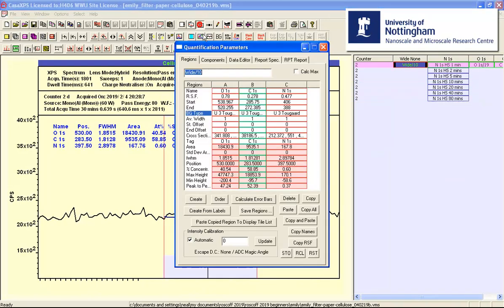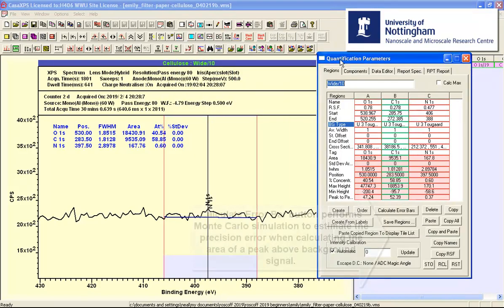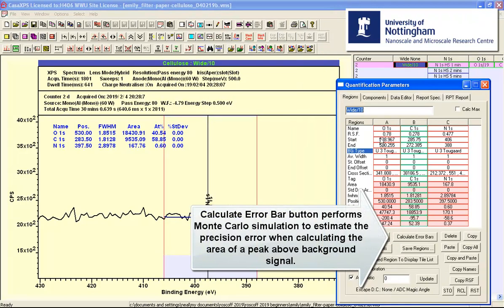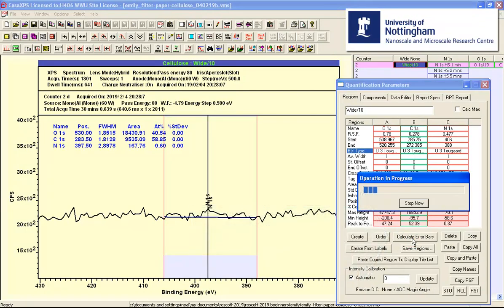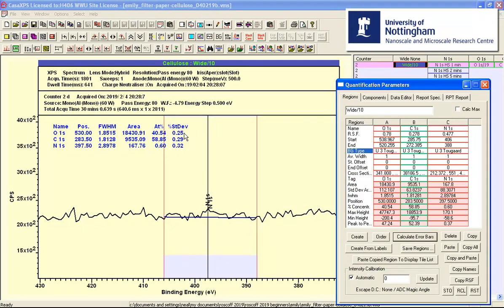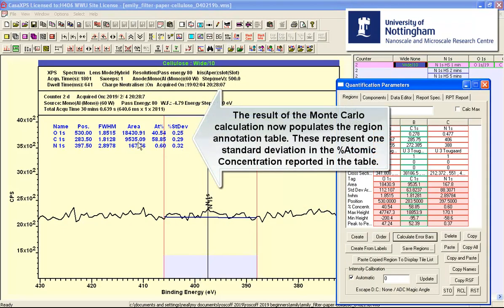I bring up the quantification parameters dialog window again. And we've got a single survey spectrum from which these regions are being calculated. So I can press the calculate error bars and this will do a Monte Carlo simulation and produce a set of uncertainties for these regions.